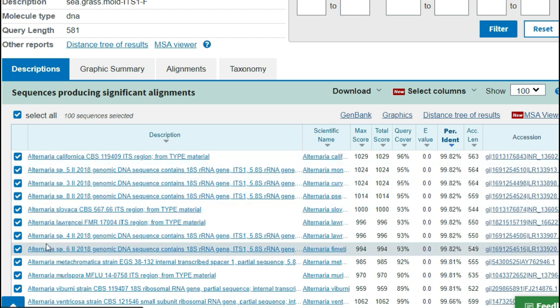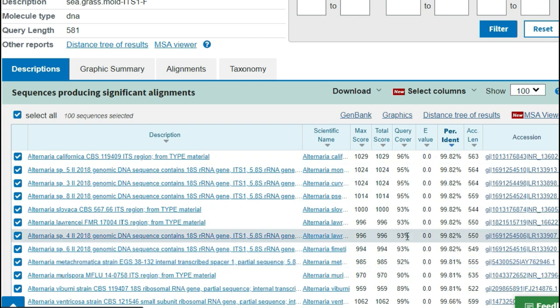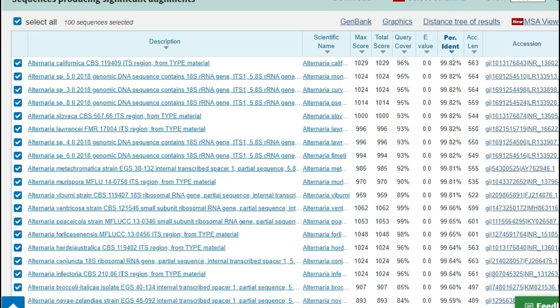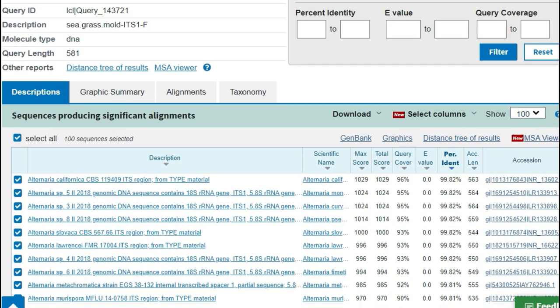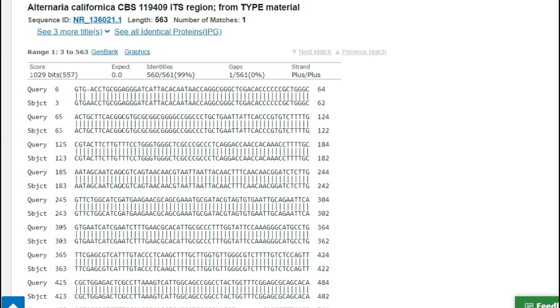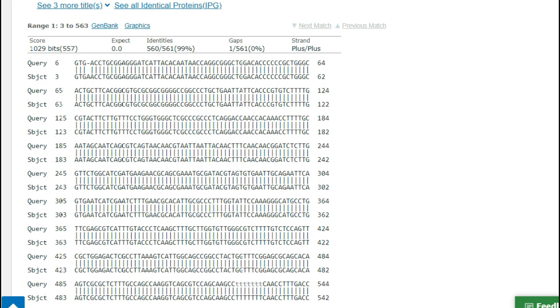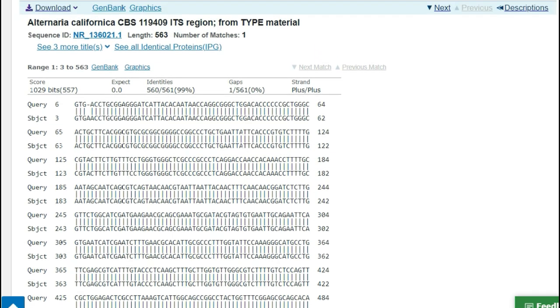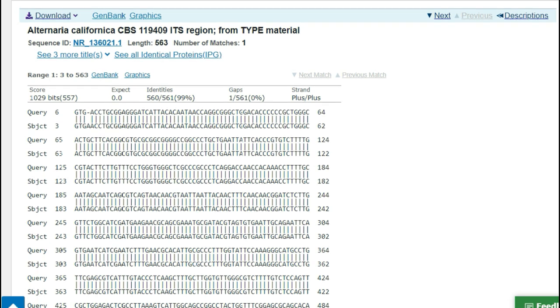But there are some other alternaria species that match closely so we need to dig into this a little bit more. If we click on the alignments tab we'll actually be able to see our sequence in alignment with the closest matches so that we can see the individual nucleotide differences. If we look at this very first one we'll see that 560 of our bases match against 561 of the top results. That means there's one nucleotide difference between the two.